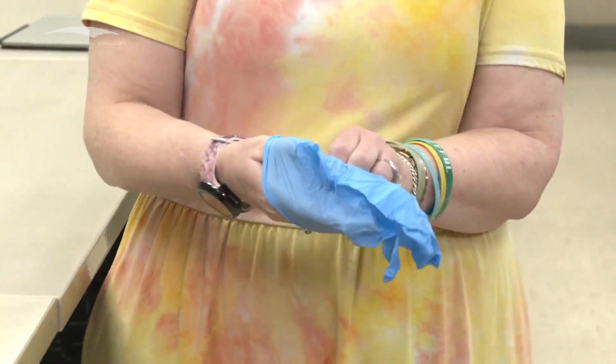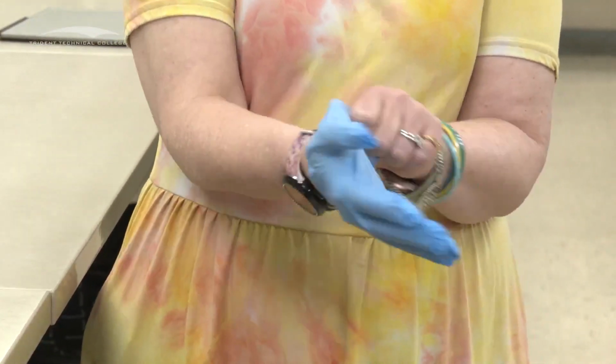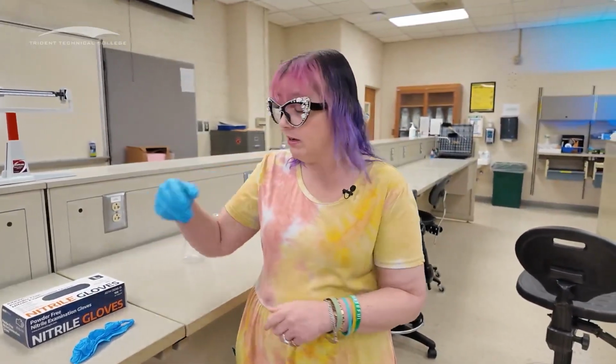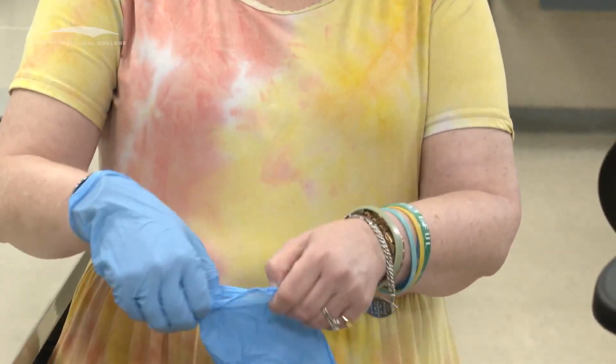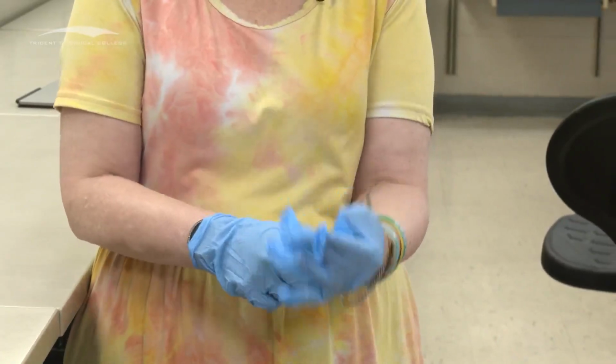We want to make sure that we get our thumbs into the thumb spots on our gloves. So that's one. I want to get that over my watch because I want to make sure I don't ruin my watch while I'm wearing it. And then I have my second one. If I can get this thing sorted out because they're all shoved in there. Not necessarily easy to put on.